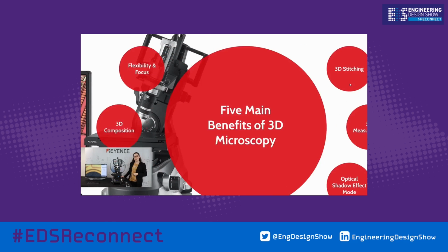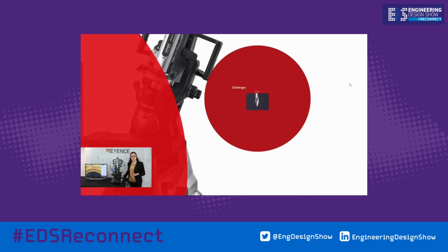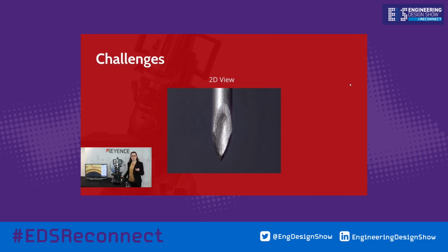Next, let's have a look at actually doing a 3D composition. Because at times it's important to understand the actual shape or the surface topography of a part. For example, there might be a raised bump or a dent in the surface. We want to actually know which one of those it is. Sometimes it can be very, very difficult to tell if it's just a black spot. It could be raised or it could be indented into the surface. With 3D microscopy, we can easily get that information about the relief of the surface and give a more detailed understanding of the 3D shape. For example, here we've got 2D view of the tip of a needle.